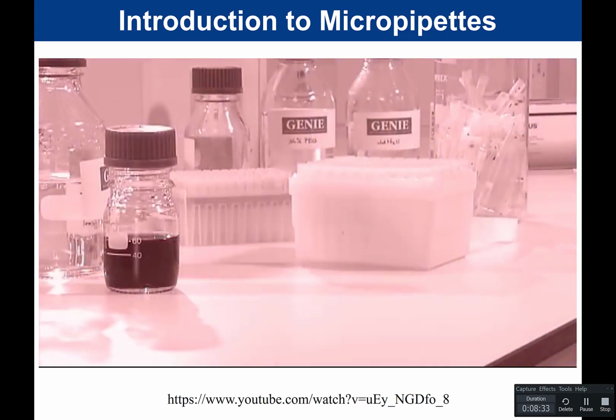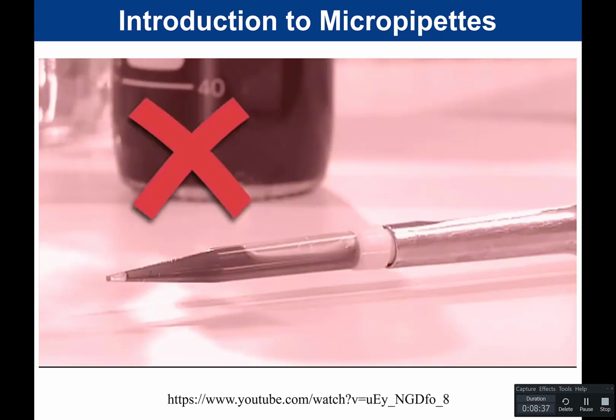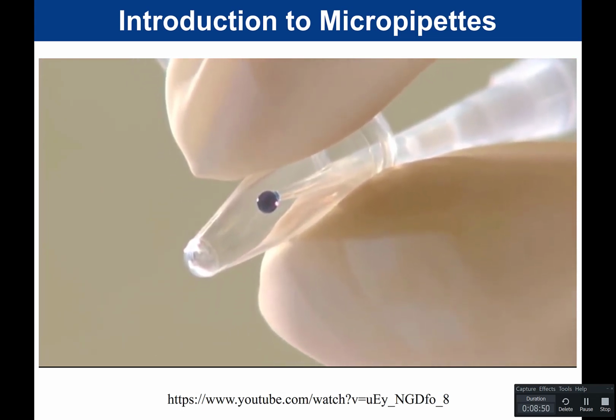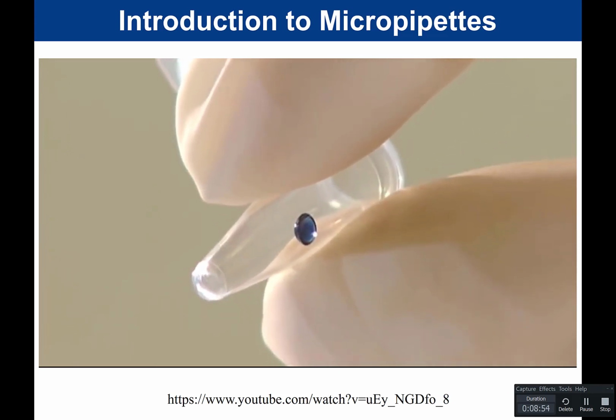Whenever you have liquid in a pipette tip, don't lay the pipette down. Liquid can get into the body of the pipette, which causes cross-contamination, pipette damage and inaccurate pipetting. And finally, remember when pipetting small volumes, touch the pipette tip to the side of the tube to ensure the liquid is released into the recipient container.